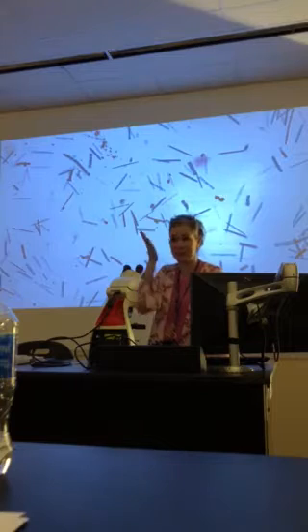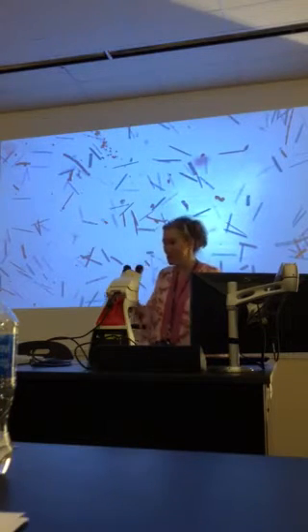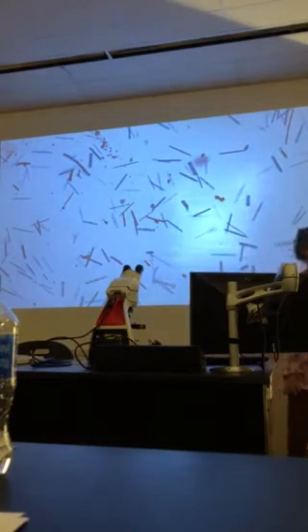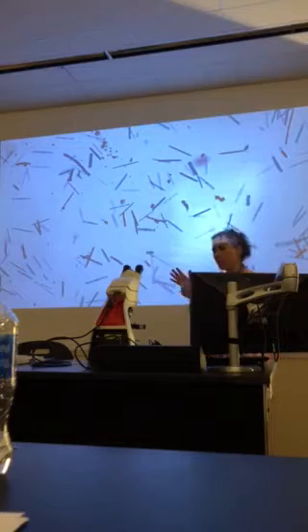Did I hear diatoms? You said diatoms, right? Diatoms. Say it louder. Those are diatoms. That's all you need. Diatoms. Nothing else. Those are easy. So we have diatoms and we have dinoflagellates.